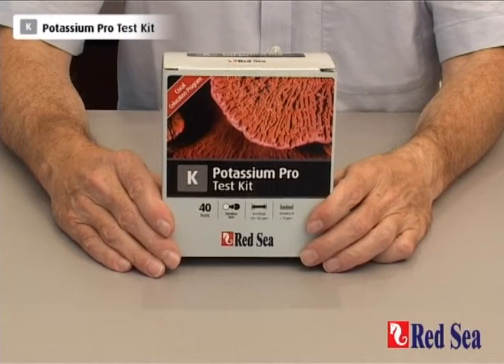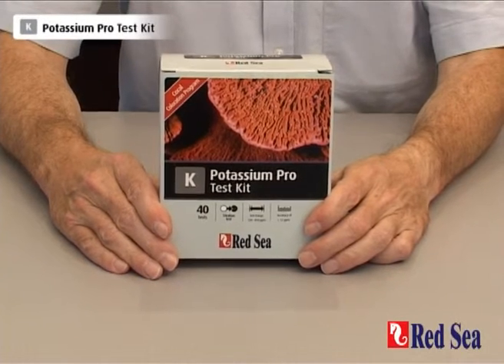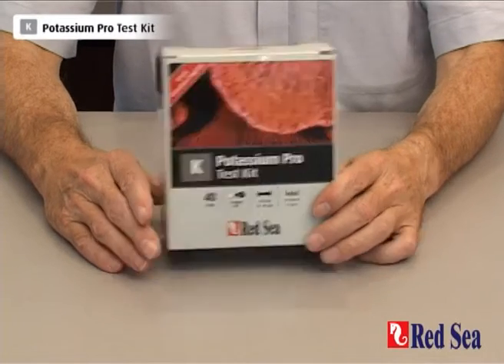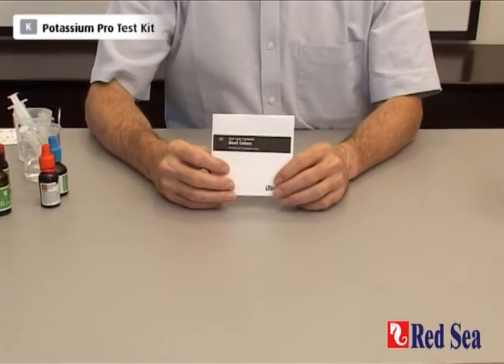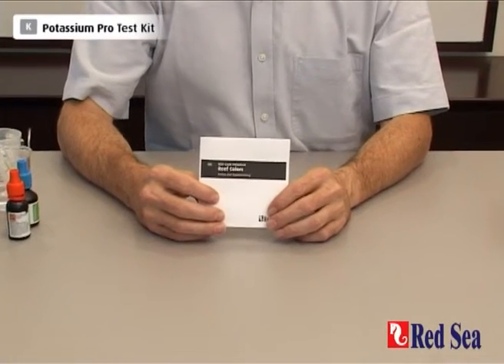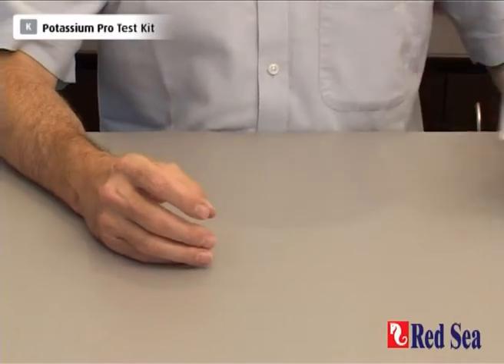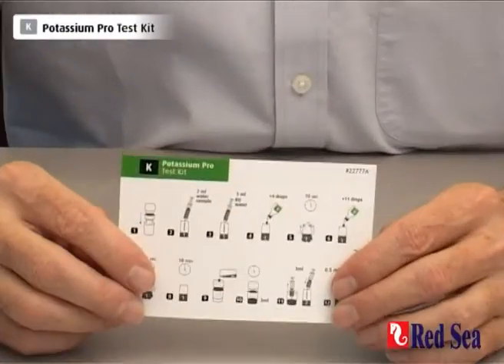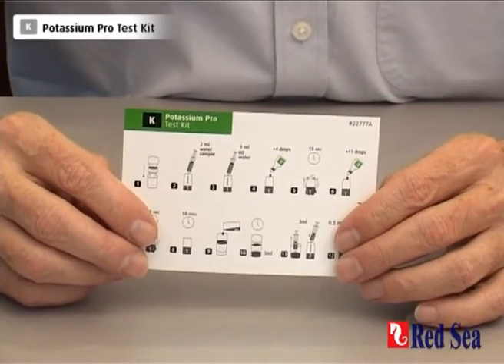Thank you for buying Red Sea's Potassium Pro test kit. The purpose of this video is to demonstrate how the test is performed. Before doing the test for the first time, read the instructions enclosed in the manual provided with the kit. There is also a colour card giving simple graphic instructions to follow while you're actually performing the test.